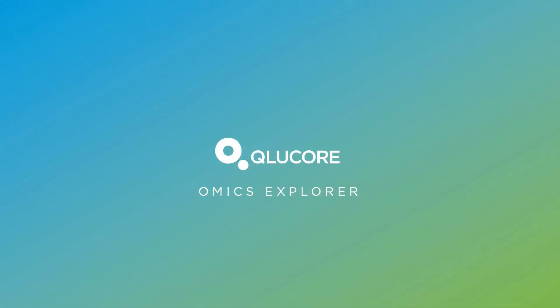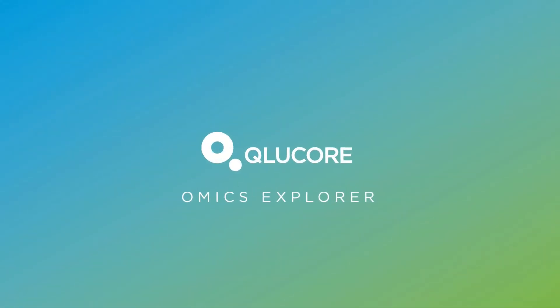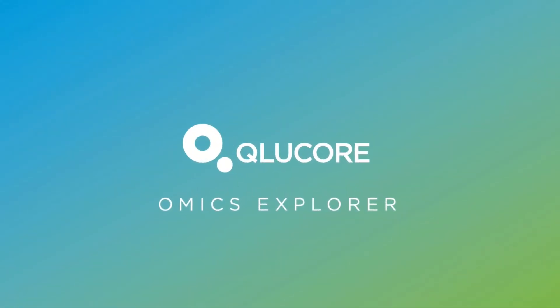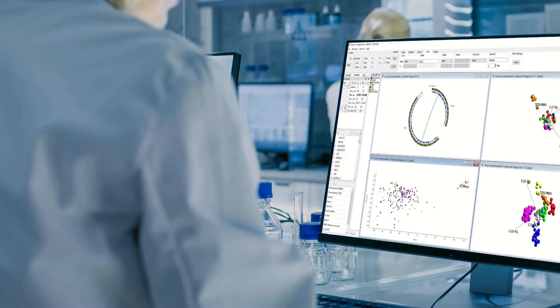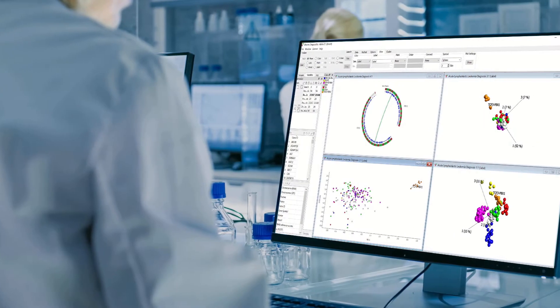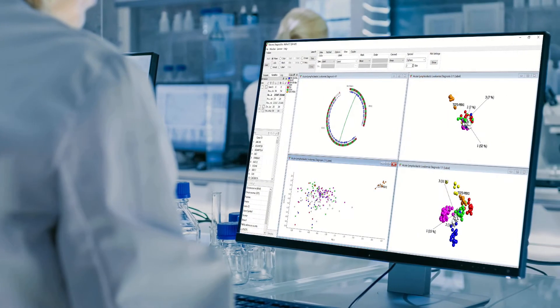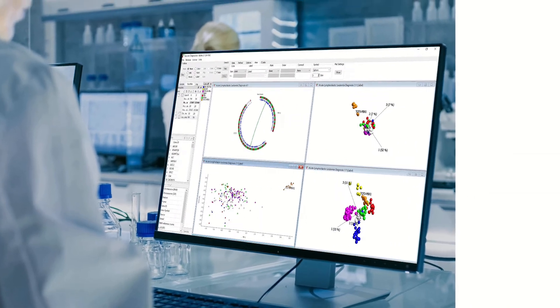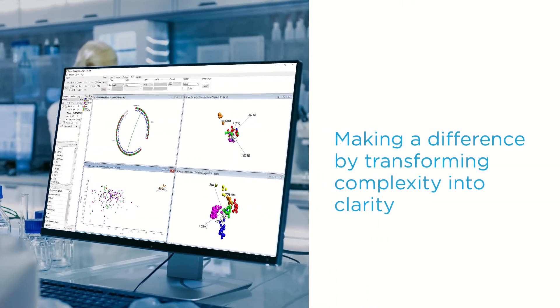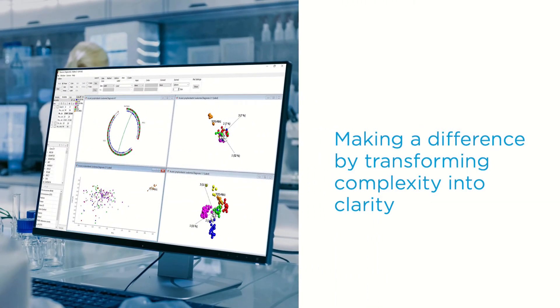Qlucore Omics Explorer makes data analysis easier and faster, and improves the exploration and interpretation of complex multi-omics data. Our mission is to transform complexity into clarity, and we do that with easy-to-use, point-and-click software, developed and tailored for the research biologist.